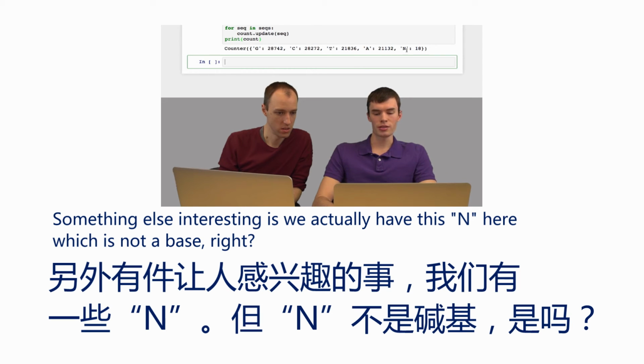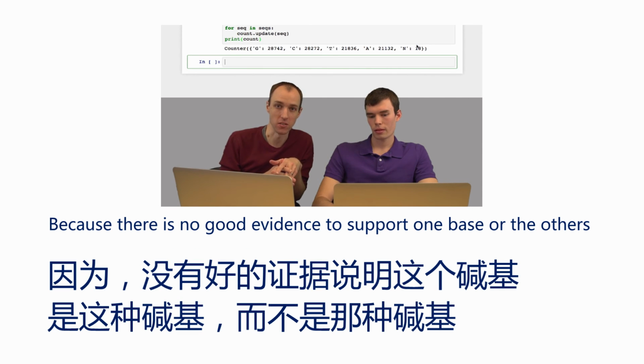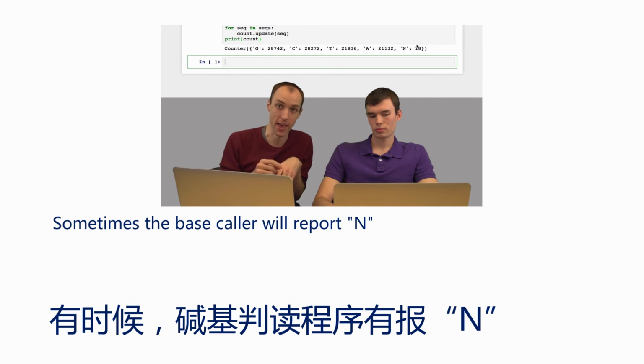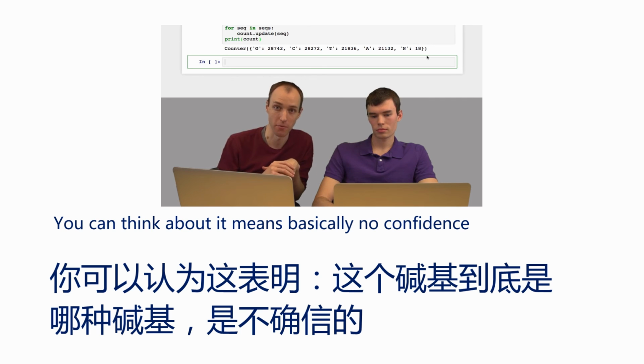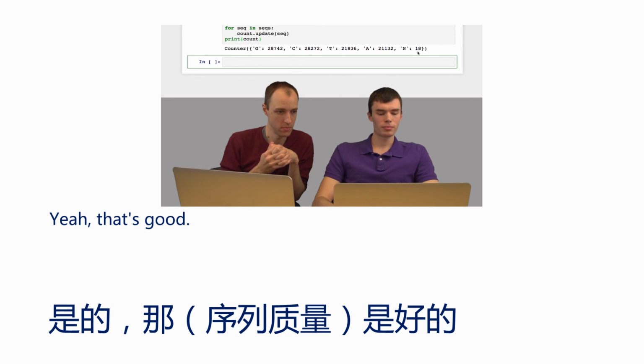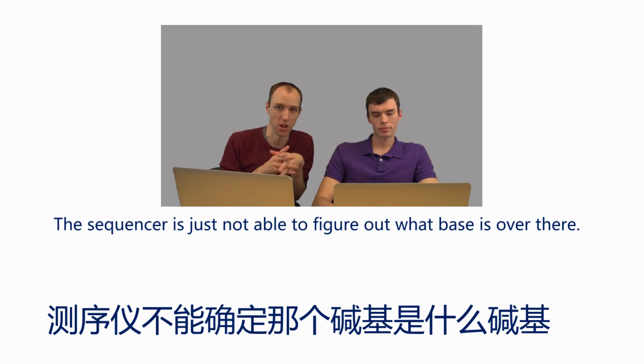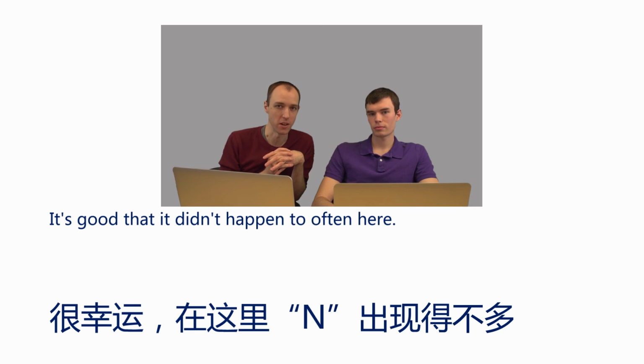Something else that's interesting is we actually have this N here, which is not a base, right? What is that? N is basically when the base caller has no confidence. It doesn't even want to make a call because there is no good evidence to support one base over the others. You can think of it as meaning basically no confidence. Thankfully in this sequencing run, the sequencer only reported N 18 times, which is very little. That's good. If you see Ns, that means something's wrong. The sequencer was just not able to figure out what base was there. So it's good that it didn't happen too often here.